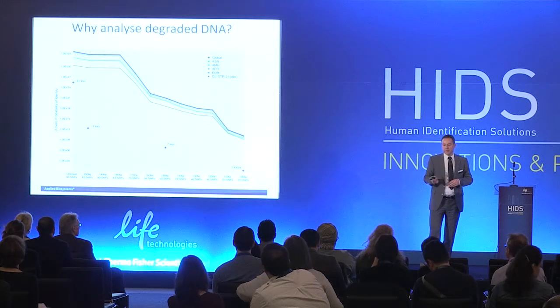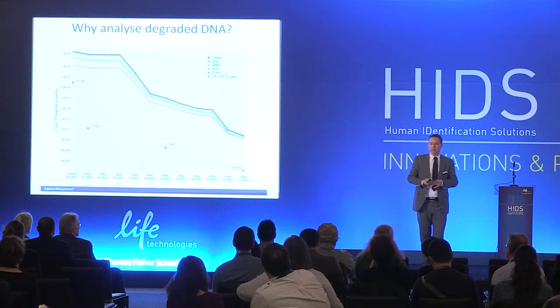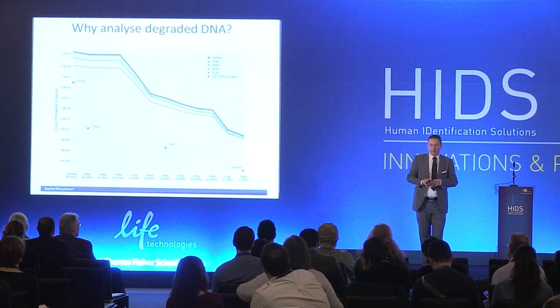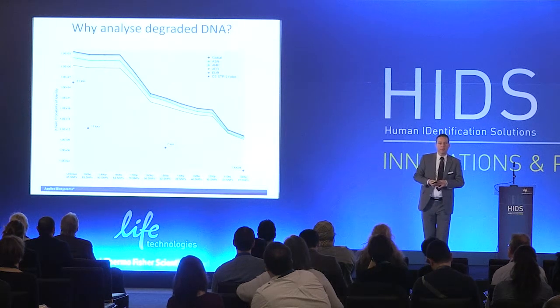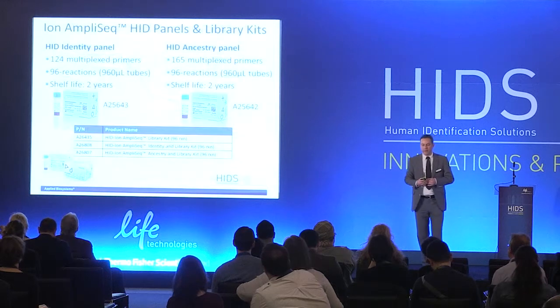And you see, for example, in this situation, in the middle, where it says 7 loci on the STR data, the STR kit is only able to recover 7 loci, but you still get much, much more information, so about 53 SNPs from the SNP panel, and you see the discrimination power you still get from the SNP data in this example. So I think it's very promising also for identity.